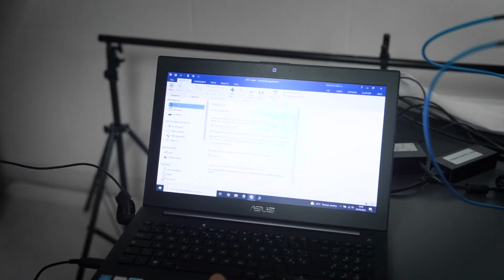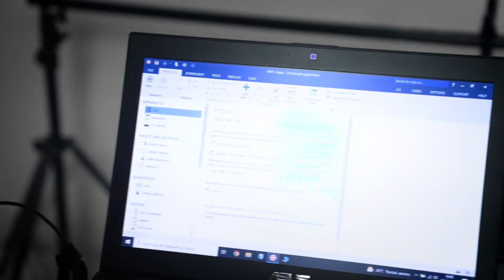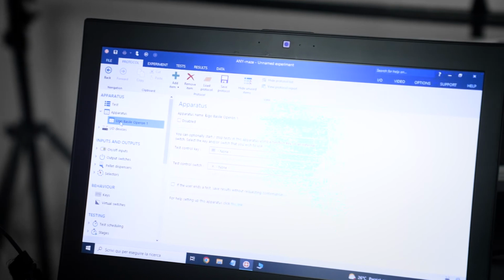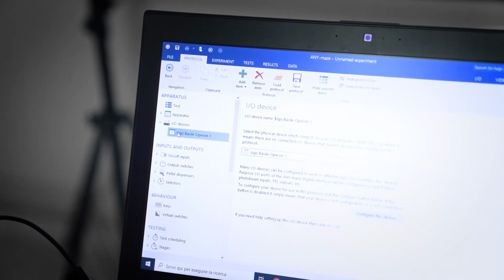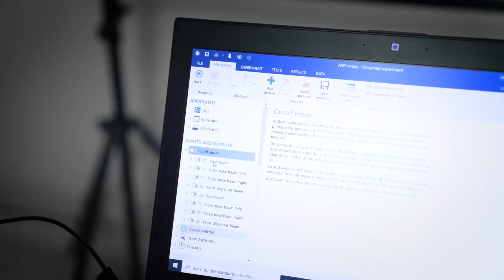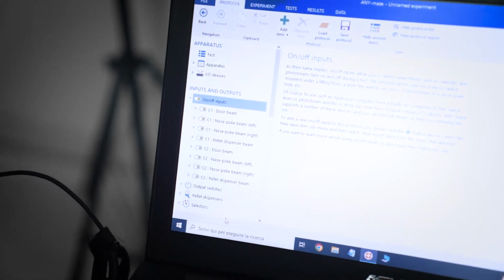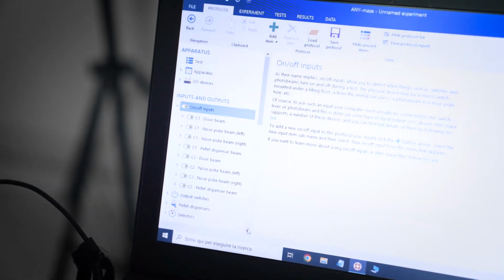As you can see, we have an Ugo Basile Operon mode with some standard sub modes, which prepare animals ready for working with this apparatus. Okay, and all the I/O devices are here, but nothing needs to be done because it is already pre-configured. But you still have here the possibility to see what is happening in the different switches which I showed you in the I/O selector.